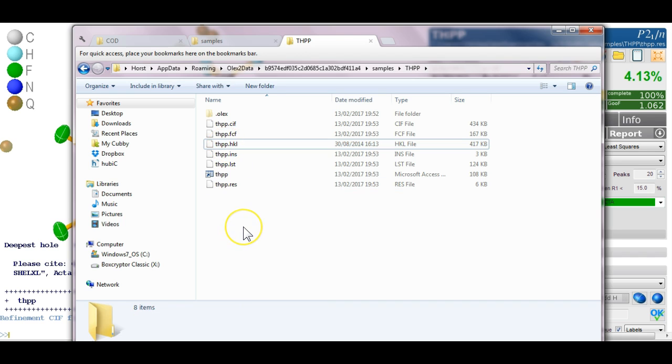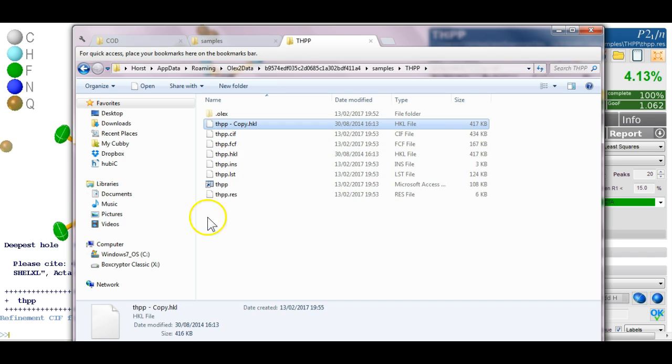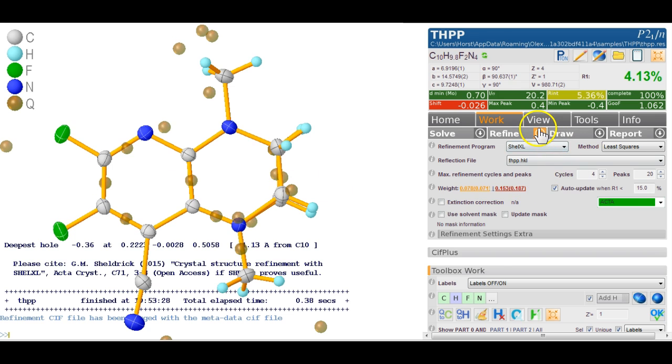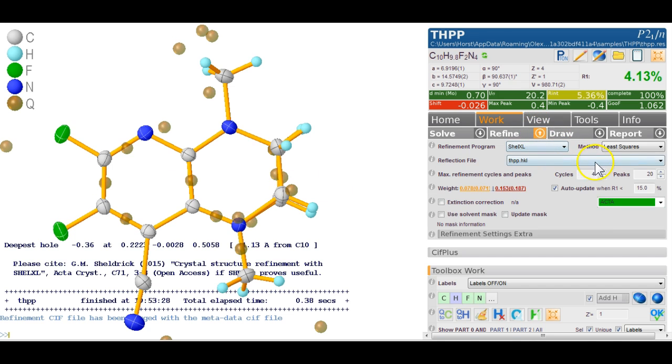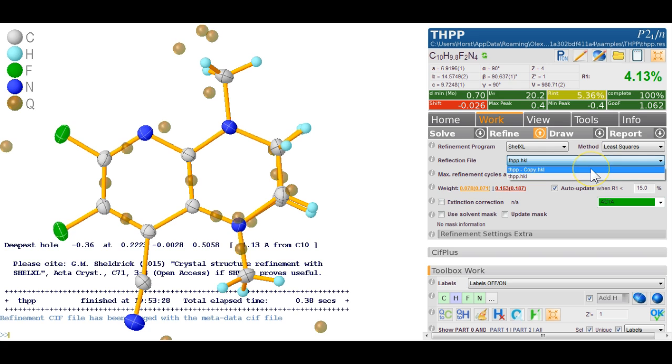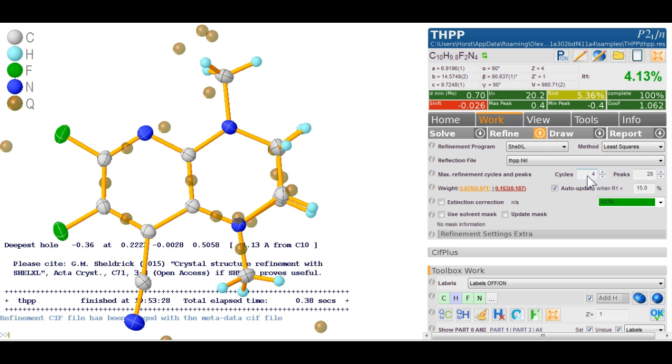And if I now click on the refinement settings I can see that I can either refine against this HKL or that HKL. In this case of course they're identical but you see where I'm going here so you don't have to copy any files manually.